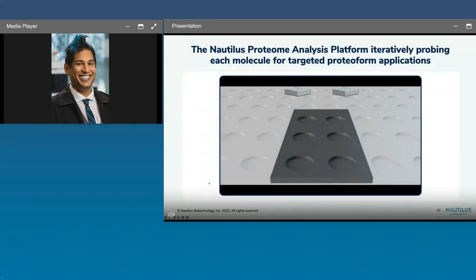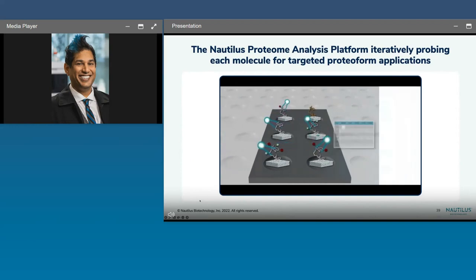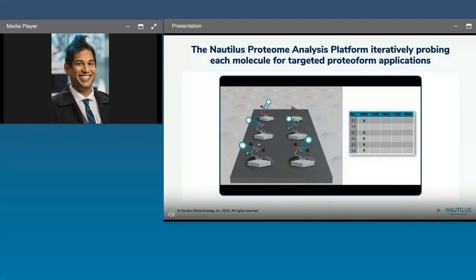For targeted proteoform analysis, as I mentioned before, we start by immobilizing our proteins. We'll then probe with a targeted probe, such as for EGFR shown in this instance, to localize where all the EGFRs are, and then come in with a position-specific probe that allows us to say, oh, you have a modification at this loci. Wipe it off, come in again with another probe that binds to a different loci, and again, build up a pattern that says, oh, this particular molecule has modifications at those sites. Do this again, wipe off, and over time, again, building up more and more information on a per molecule basis. And with as few as six cycles, one is able to potentially elaborate 32 distinct proteoforms.